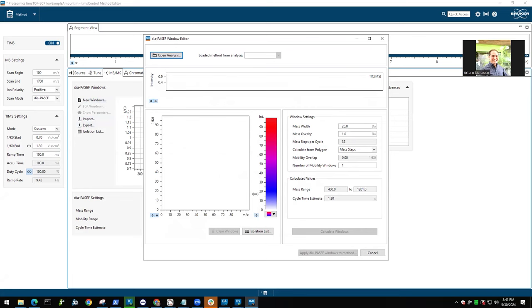So what I always do is I use existing ones and modify them the way I want them to be, because you want to make sure that you're not wasting time. The thing is, you can't show up in ion mobility again once those ions are out of the trap. When you say, I focus on this at 800 m/z, you can't go to 600 and then back to 900 and go to the higher ion mobility range again, because those molecules are already out of the TIMS, and you have to wait for the next ramp that is tight.